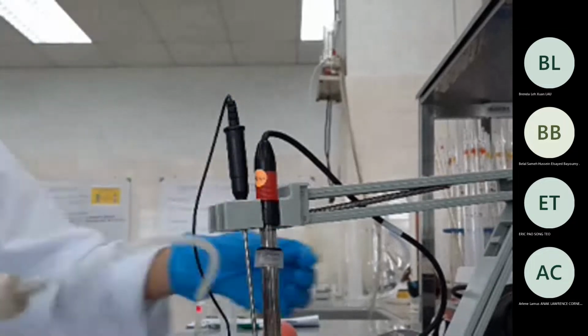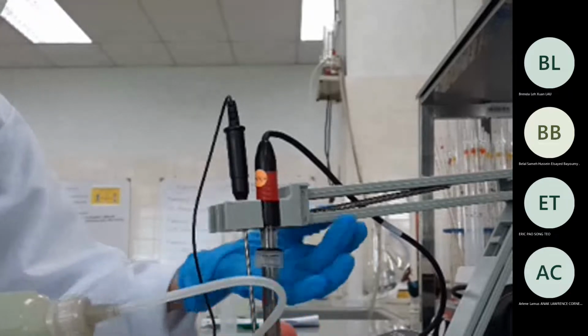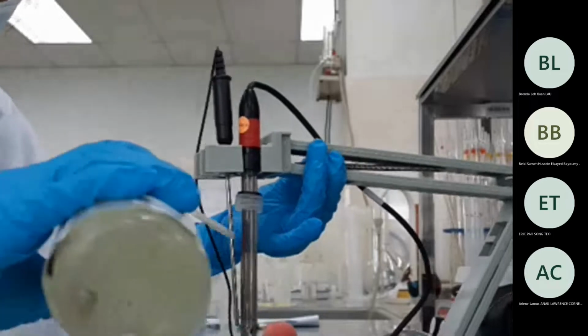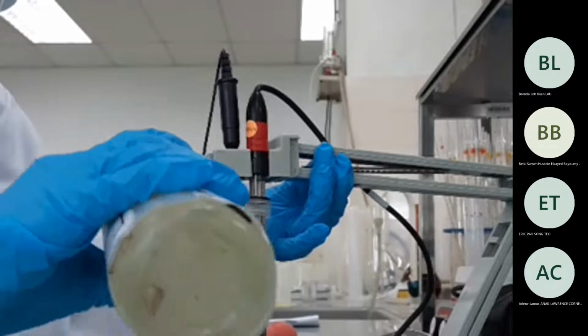At least to touch, no need to be too much. This is why we do not allow this type of setup, one drop of acid falls on your knee.